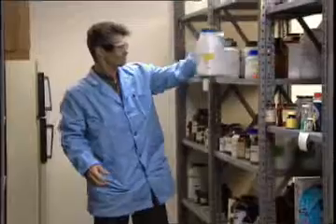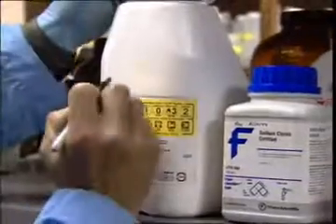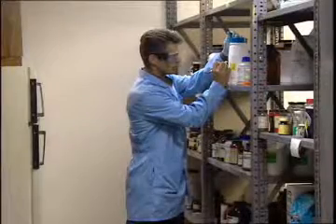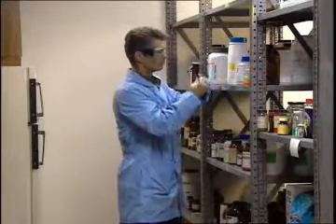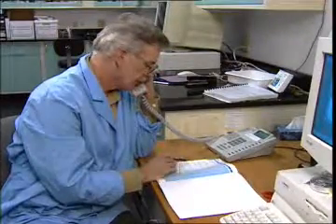When stocking supplies, make sure that all materials are clearly labeled, including the CAS number, and dated with the received date. Use older materials first to avoid expiration. Lab personnel should share chemicals and stocks to the maximum extent possible. If you need a new reagent or standard solution, first check if it is available in the stockroom or from another lab.